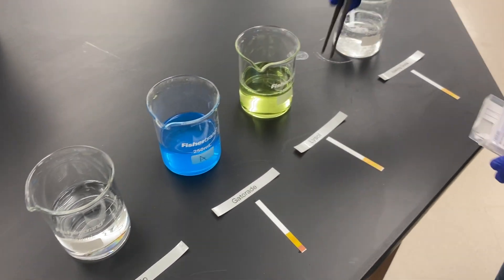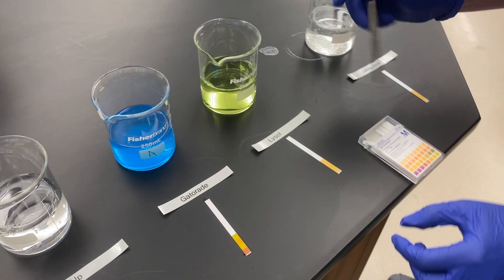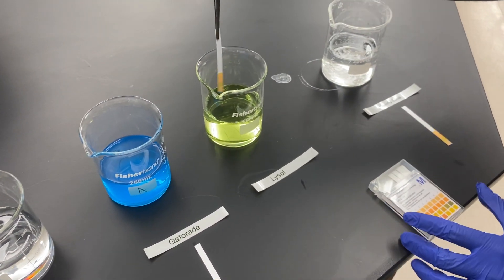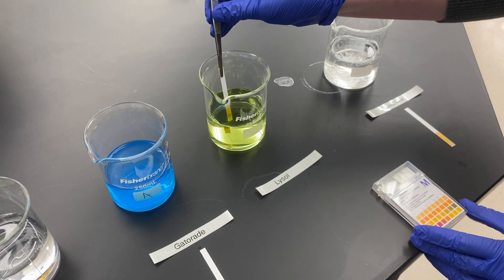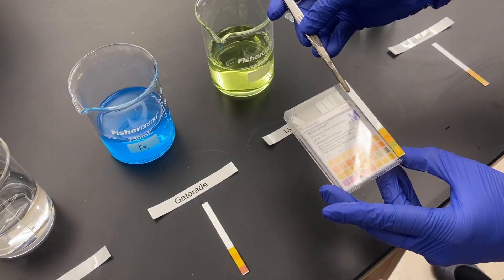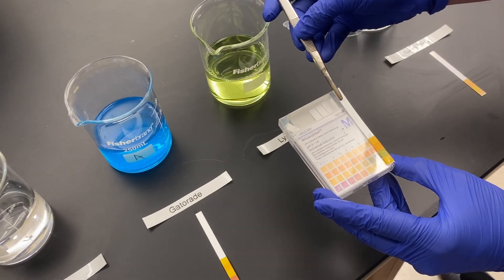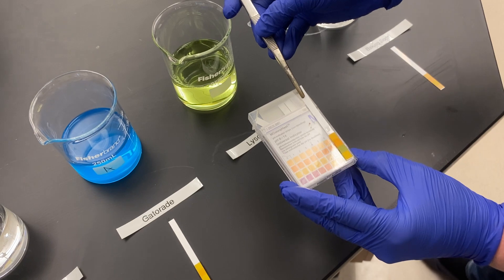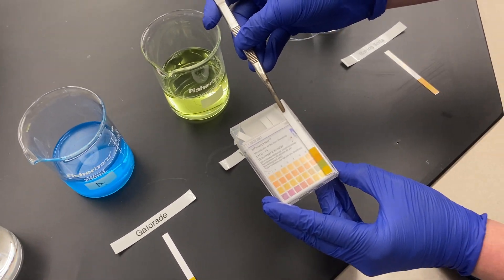Then we have some other more interesting options. We have a Lysol spray and we're going to test its pH. This is actually pretty close to neutral — not quite dark enough for 7, so it would probably be closer to a pH of 6.